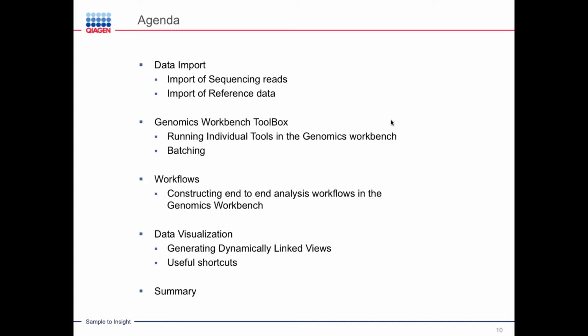To achieve that aim, this is the agenda that we're going to go through. We're going to focus on data import, like how to import my raw sequencing reads and reference data into the workbench. Then we're going to focus on what tools are available overall in the Genomics Workbench, and then how to run those tools.